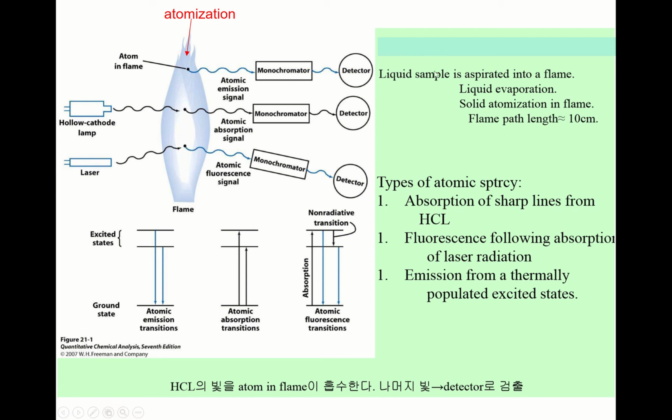Here a liquid sample is aspirated into the flame. Liquid evaporation takes place. And also a solid could be atomized in the flame. The flame path length is about 10 centimeters long. Okay, you'll see soon.